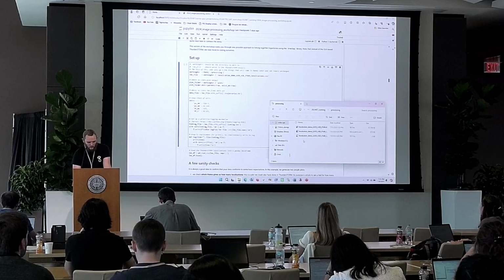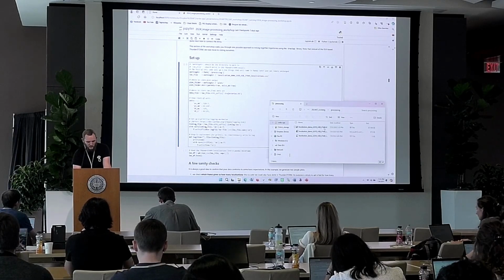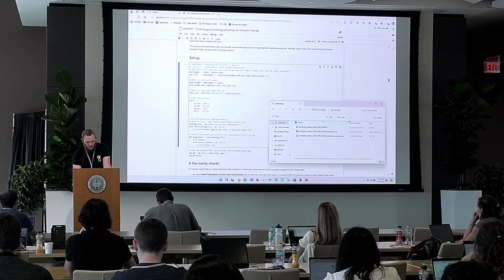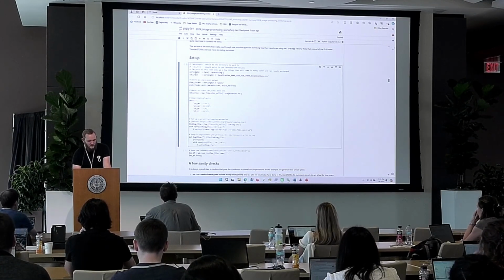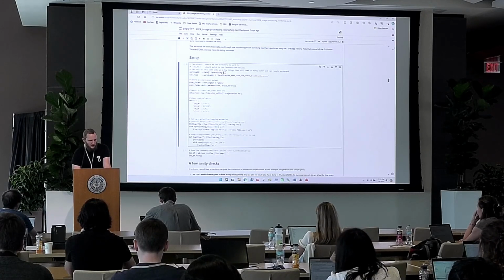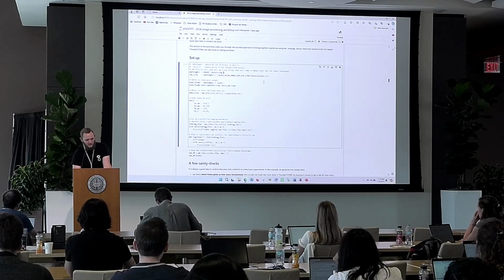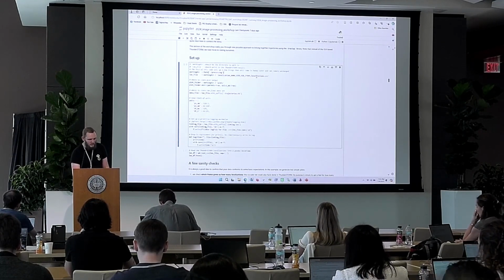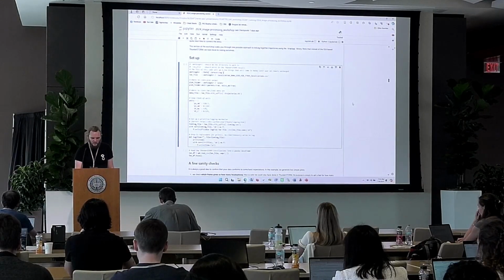I have this folder called processing. The movie is in there. That's also where I stored the CSV, the localizations. And that's what I'm putting in this working dir variable here. Then I just tell the code that the localizations to load are this file in that directory. The rest is not particularly important right now, so we can just run this cell.